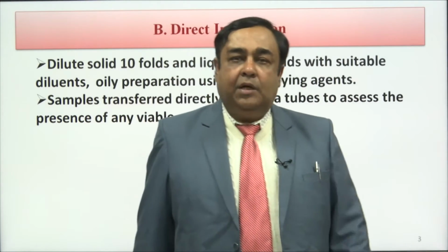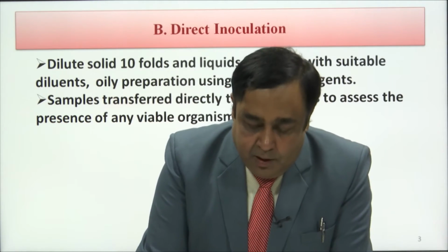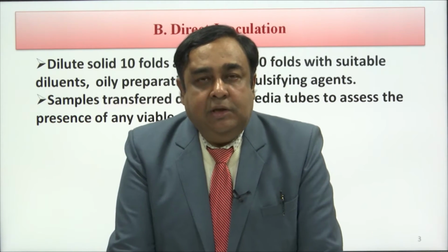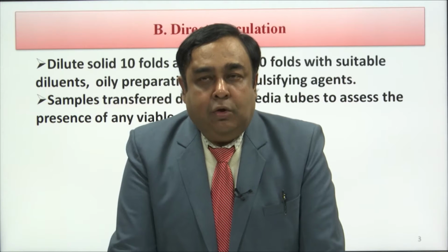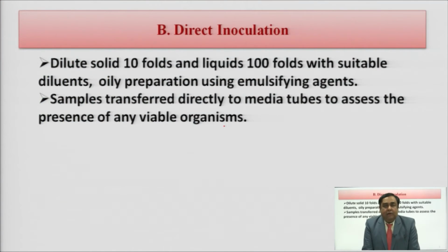Now, the term direct inoculation. Let me quickly recapitulate that sterility testing is basically done by two methods. One was the membrane filtration technique, and the second one was the direct inoculation technique.